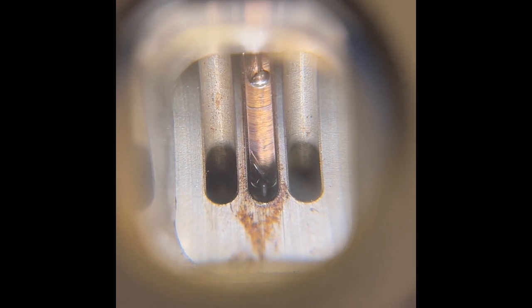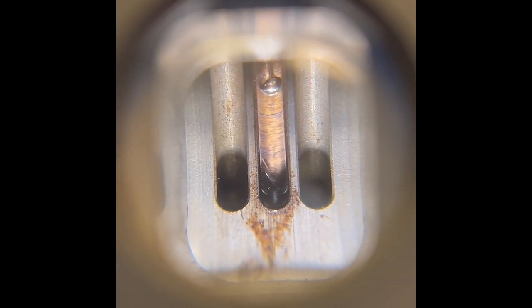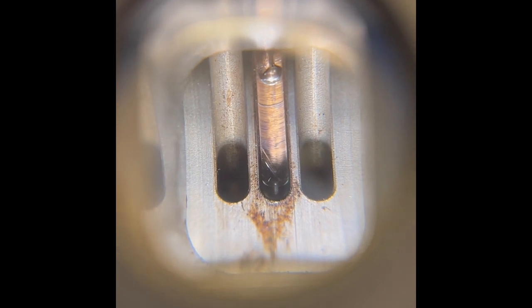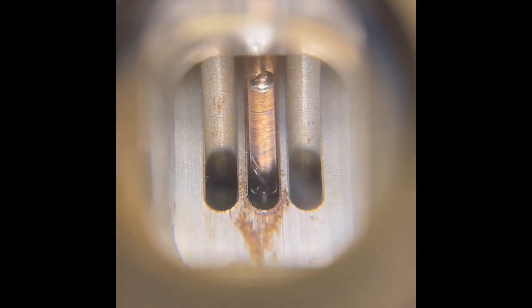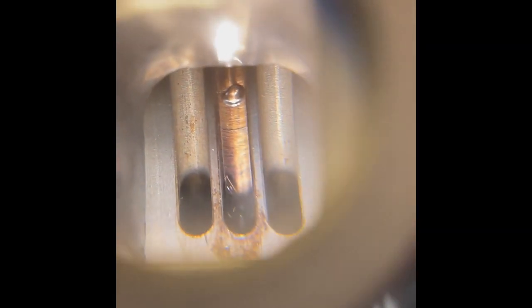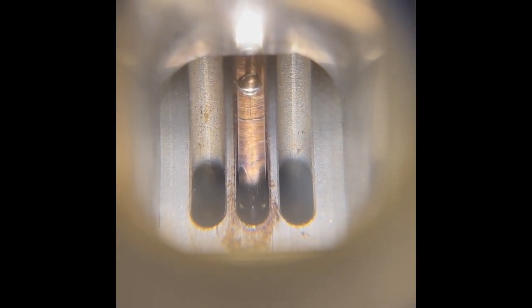But we really want to just make sure that it's streaming like very fast, like super fast bubbles. Almost maybe even to the point where you can't see individual bubbles, I guess. And then at that point we will stop the temperature. We will not turn it off. We'll just stop it, so that way it starts to cool. And then we can start keeping an eye out for it to see if it enters the capillary tube. I'm a little bit concerned that this is almost out of the window, because once the bubbles start to form, it might actually float up. So yeah, we'll see what happens.